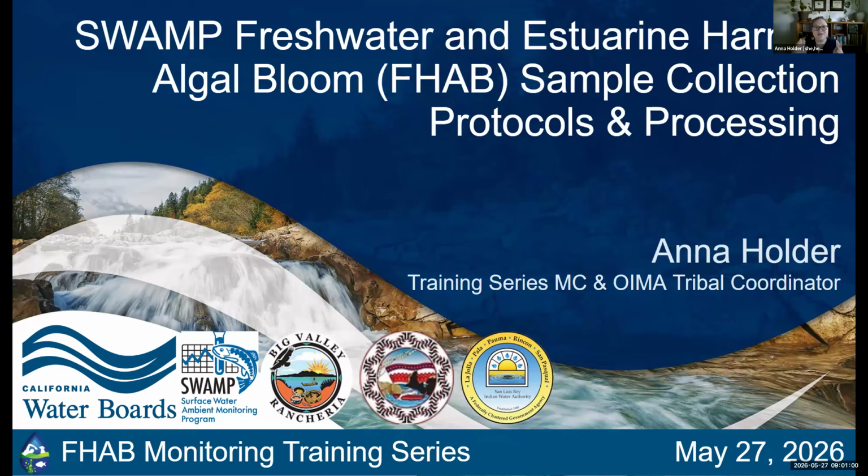This is our fifth course in our SWAMP, freshwater, and estuary and harmful algal bloom training series. Today, we're going to be diving deep into sample collection protocols and some things to consider when you're thinking about processing those samples or sending them to the lab for analysis.